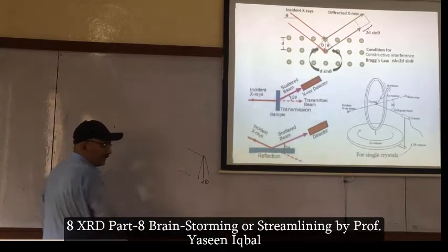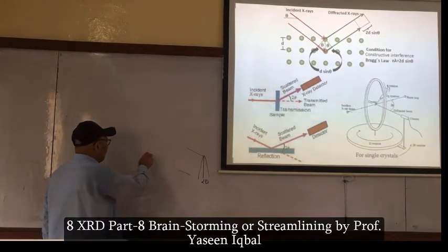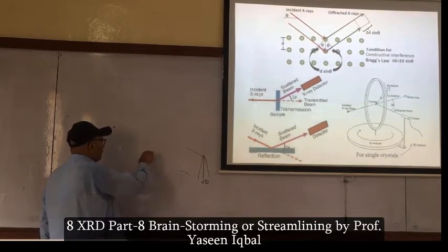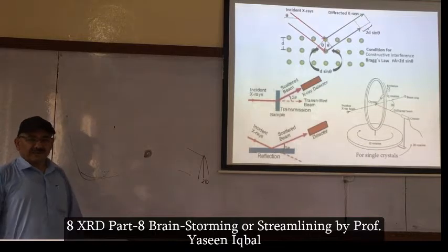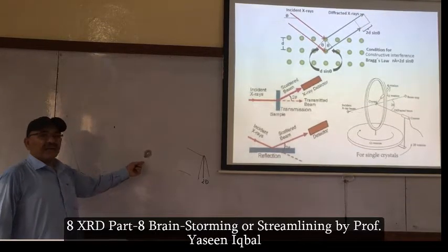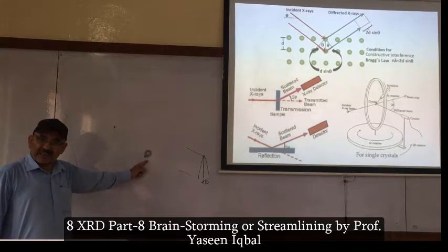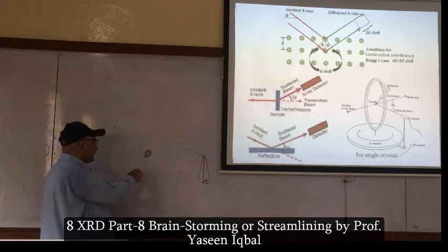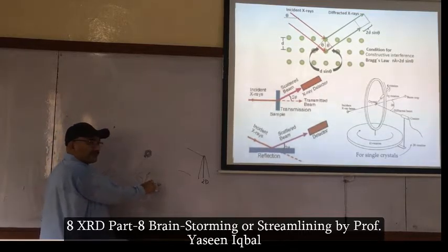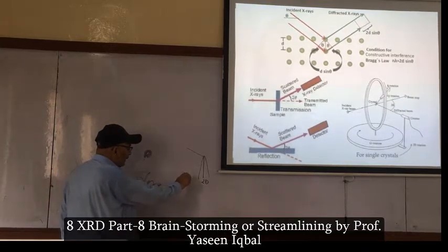then you can understand it now that if you have a diffraction pattern like this, and the electron diffraction, it is a diffused ring. A diffused ring is a representative of glass. Amorphous.